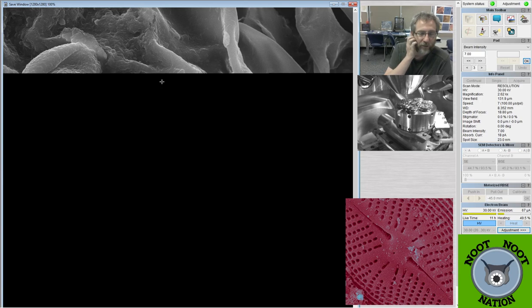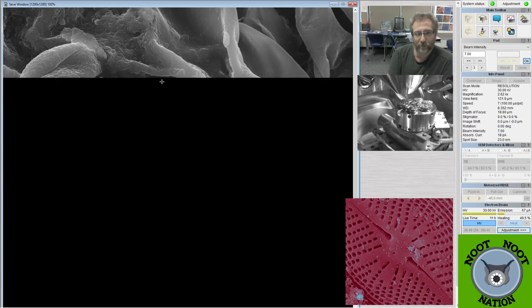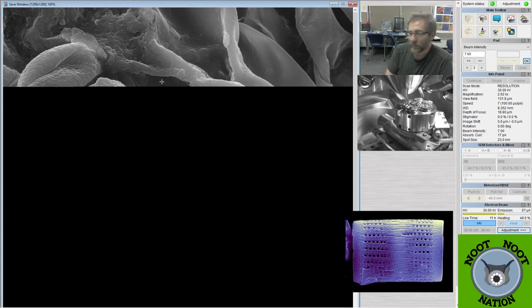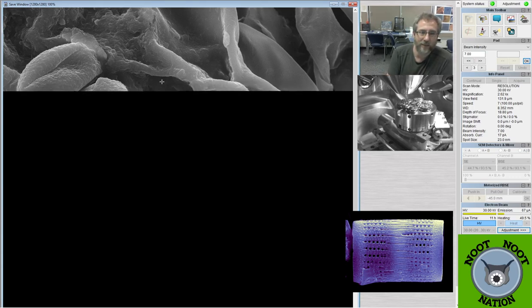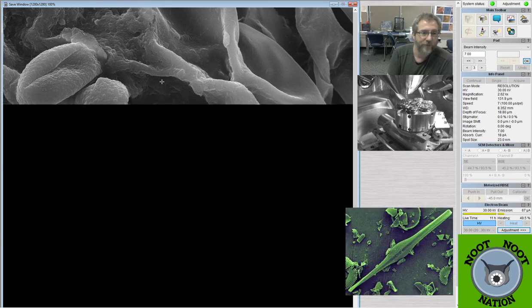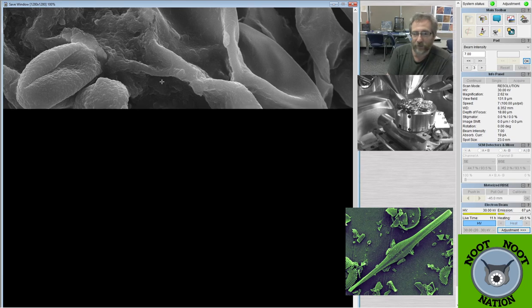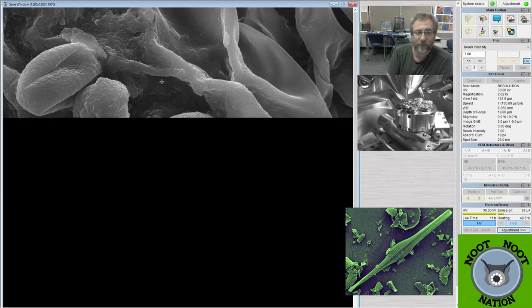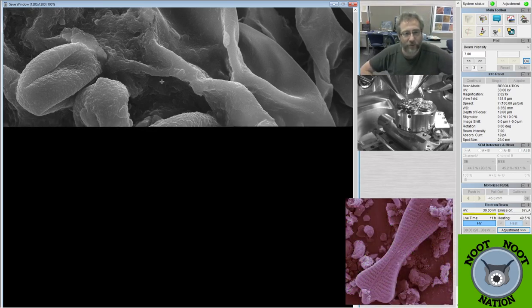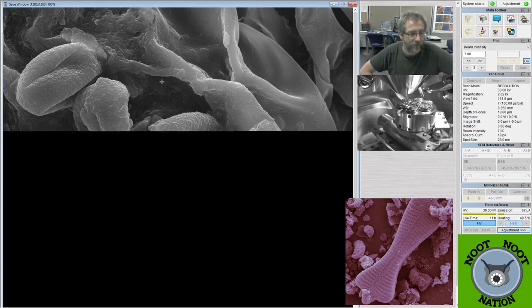It's been really heavy pollen here the last couple of days, but all tree pollen. And probably a lot of this and the maple, because the trees are blooming. Redbud is out pretty heavily right now. Last week, the magnolias were out, and I went to try to collect some magnolia pollen, and all the flower petals had already fallen off the tree by this point, in the one on campus that I thought about collecting from on Saturday.